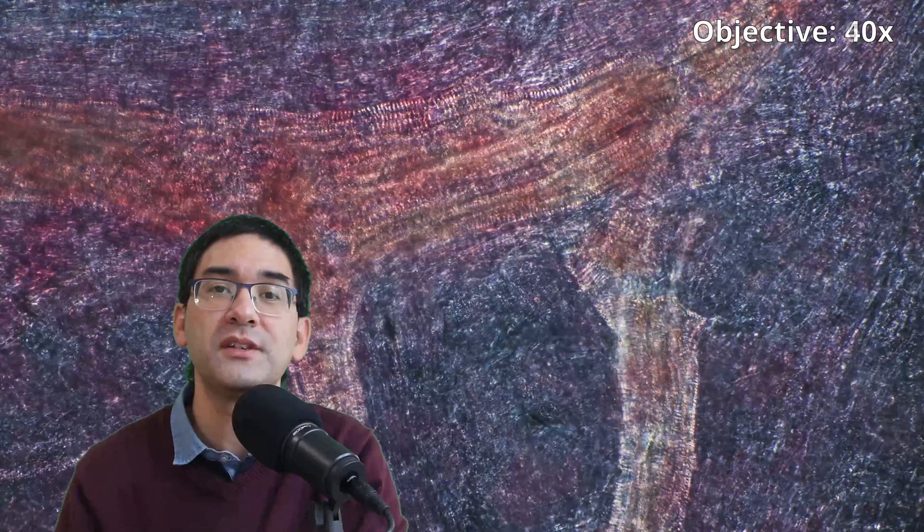Because what you see here, this is the so-called vascular tissue. These are cells that transport the water inside a plant, and the spiral ring-shaped structures that you see there, this is called xylem. And xylem is the tissue of a plant that transports the water, and those ring-shaped structures, they give the cells the strength so that they do not collapse when they transport water.